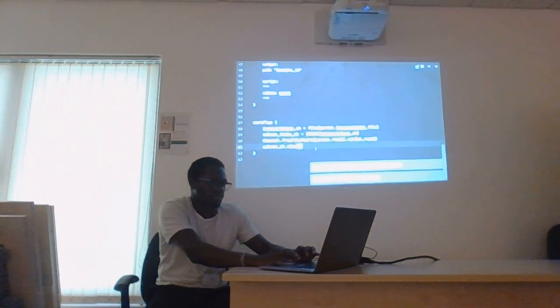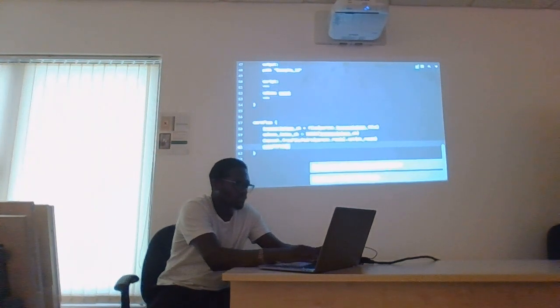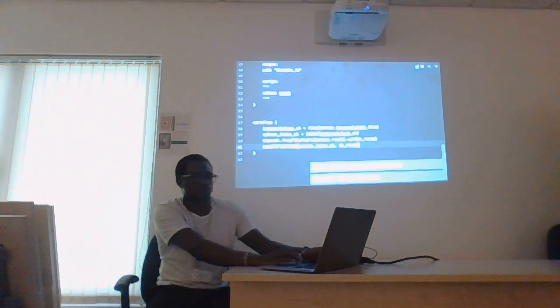So if I want to run the quantification process, I would simply do quantification. I expect Salmon. The order has to be the way you have defined them in your inputs. Channel, and then this would be channel width.